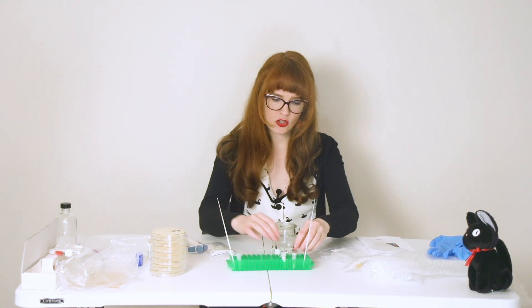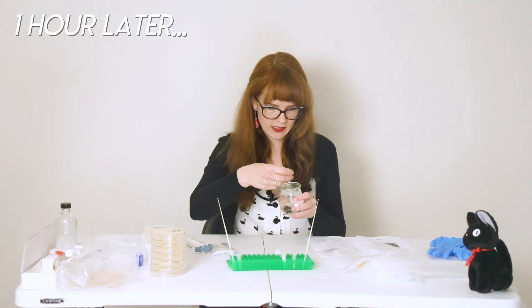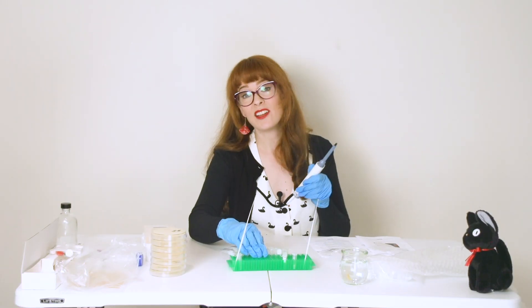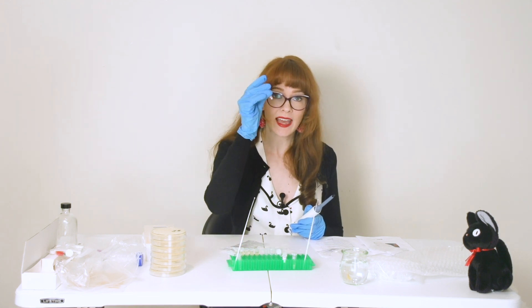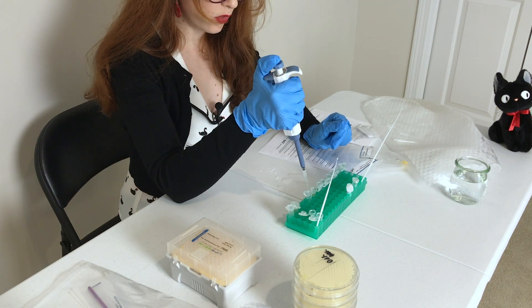Pop these tubes in for an hour. We've finished incubating these. Now I'm going to add 900 microliters of my YPD mixture into my competent cell mixture with the DNA added — filling the exact amount in there, pressing it all the way.